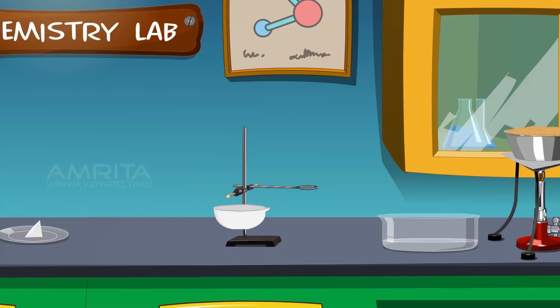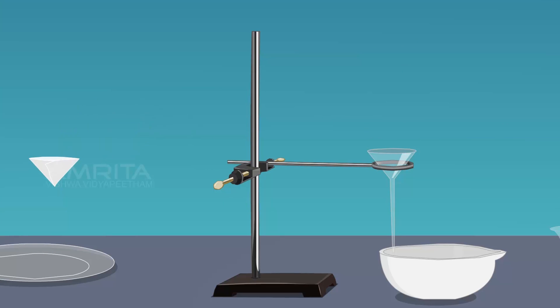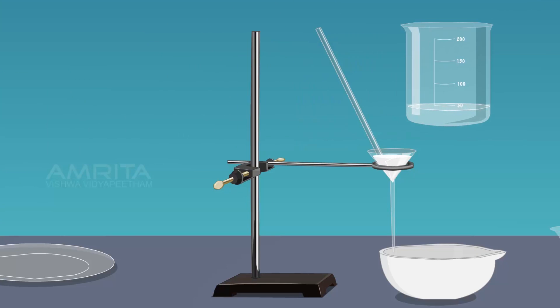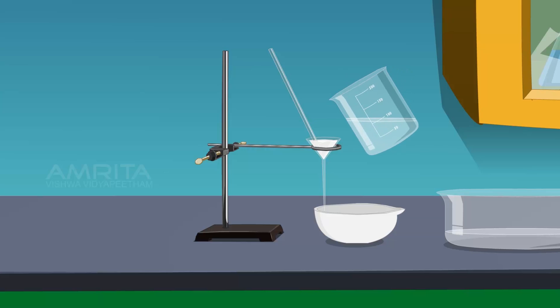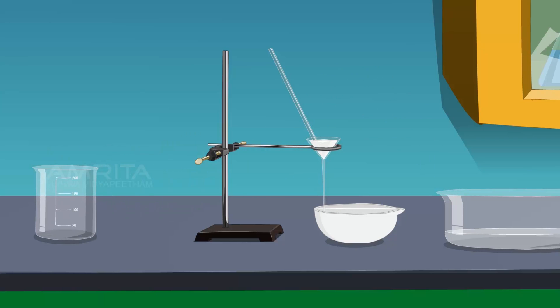Take the china dish and place it below the stand. Take the funnel and fix it to the stand. The stem of the funnel should touch the wall of the china dish to avoid splashing out of the solution. Place the filter paper in the funnel. Place the glass rod over the funnel and pour the solution into the funnel through the glass rod and collect the filtrate in the china dish. The insoluble impurities are left behind on the filter paper.